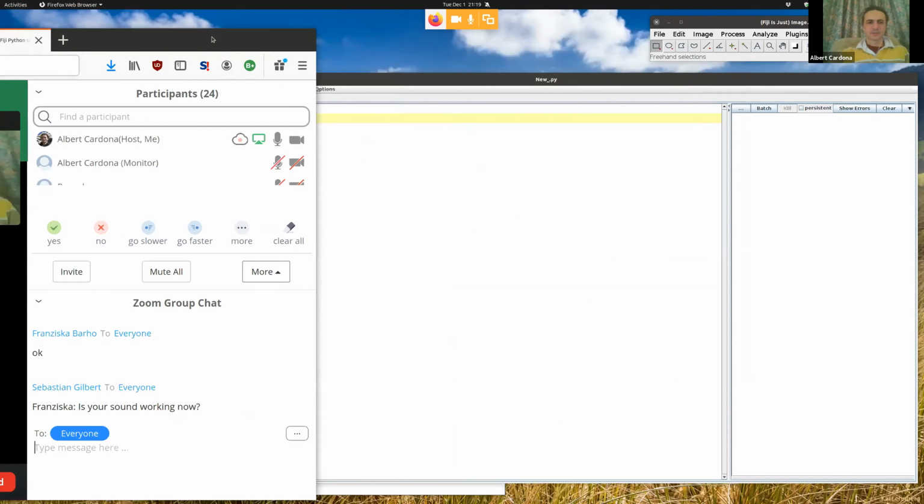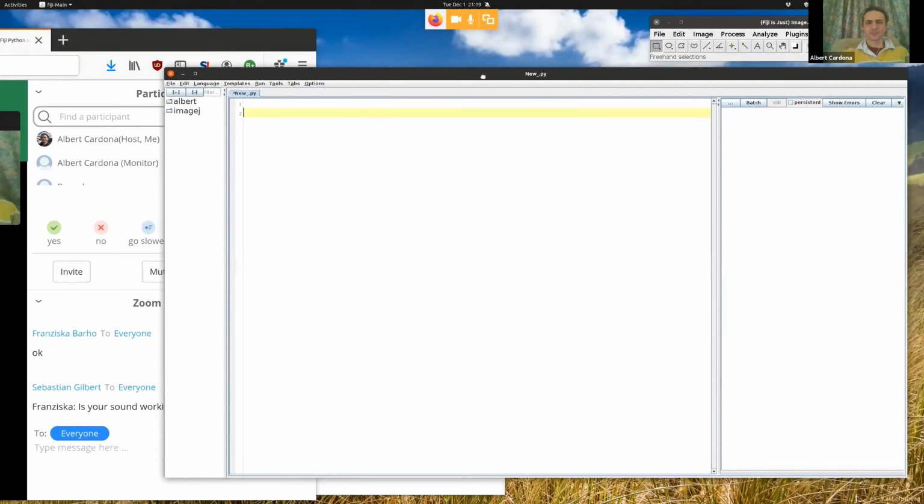What I was doing is I was trying to show you a Fiji screen. Let me see. We were trying to say how to deal with graphical interfaces, how to build them. And for that, you need to know a couple of concepts. One of these concepts is the listener pattern in programming.